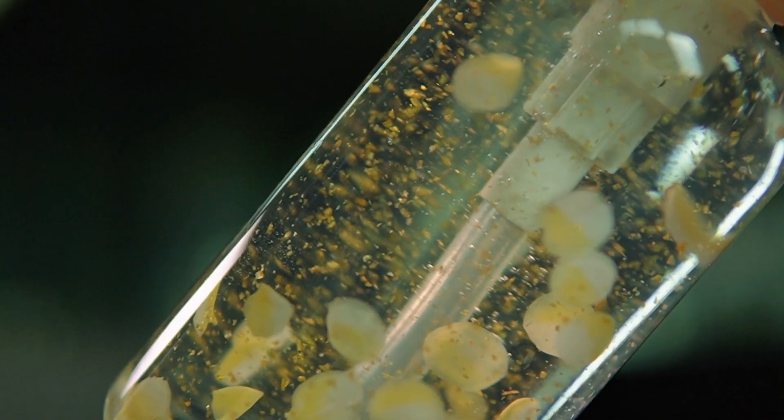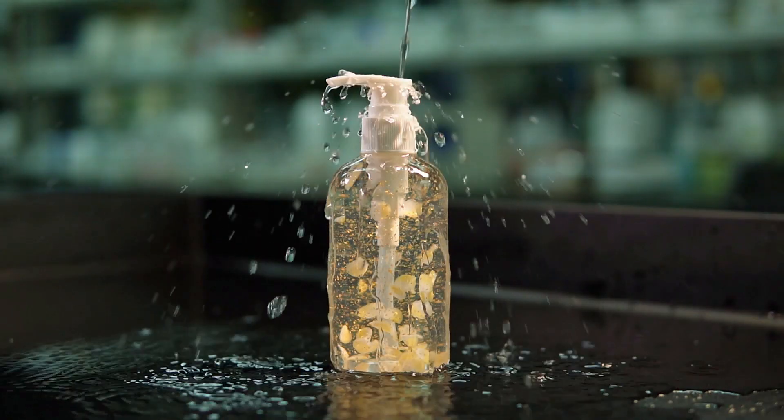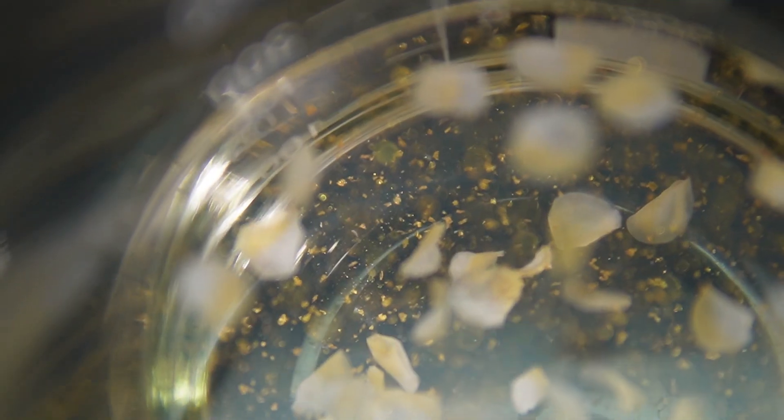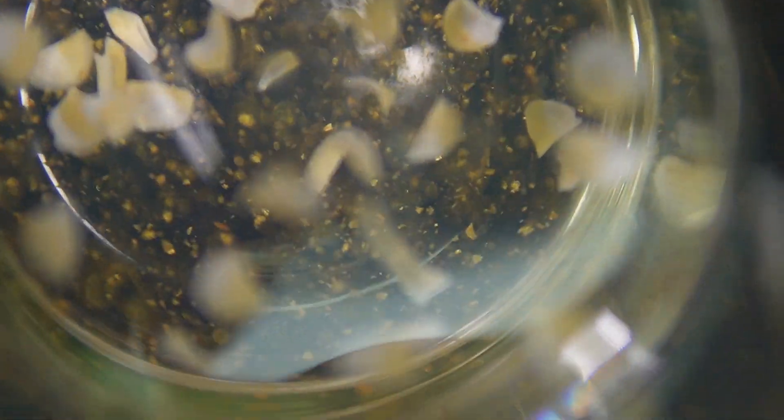Welcome to the Yeser Laboratory, where magic meets science. Today, we are thrilled to guide you through the creation of our newest innovation, the Rose Petal Reverie Bath Gel.